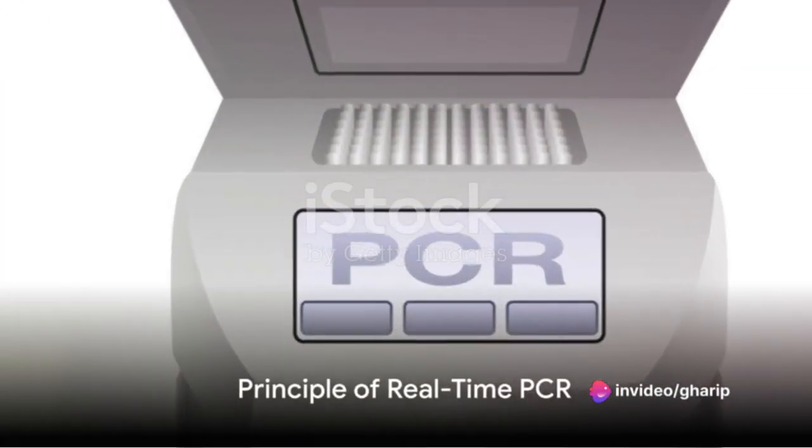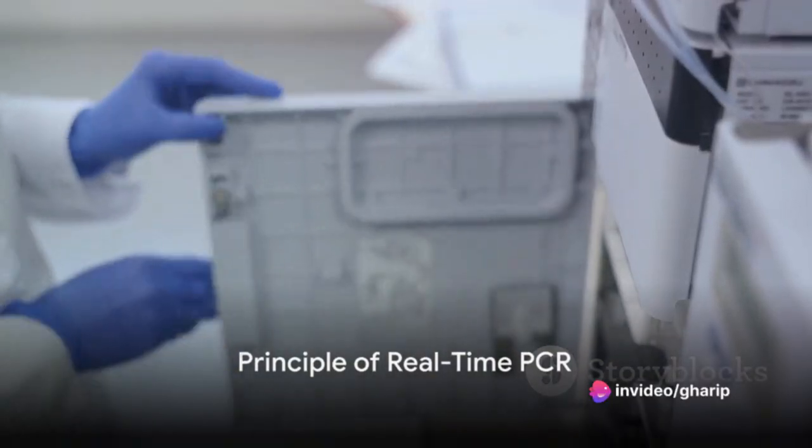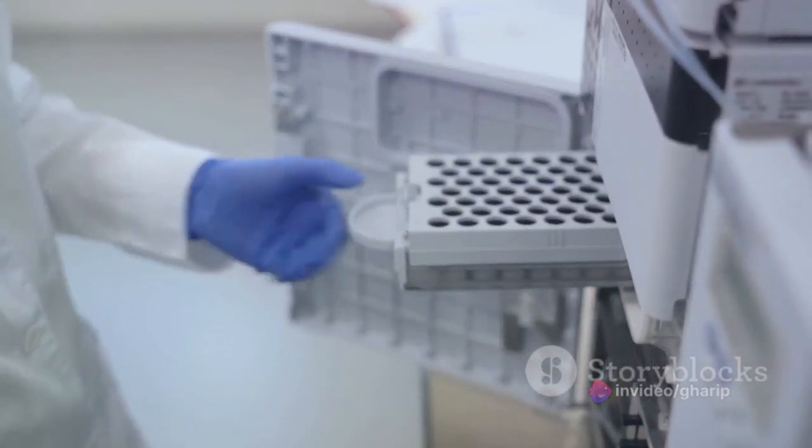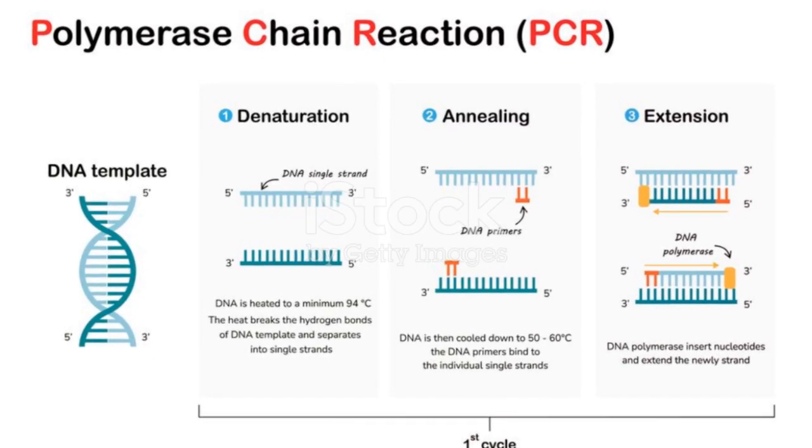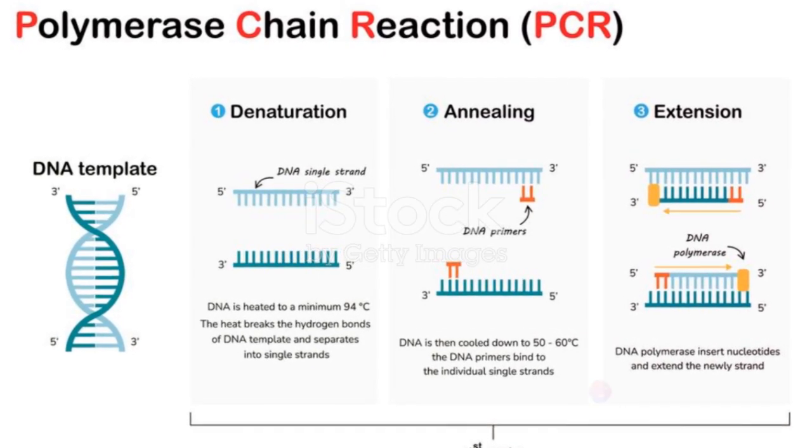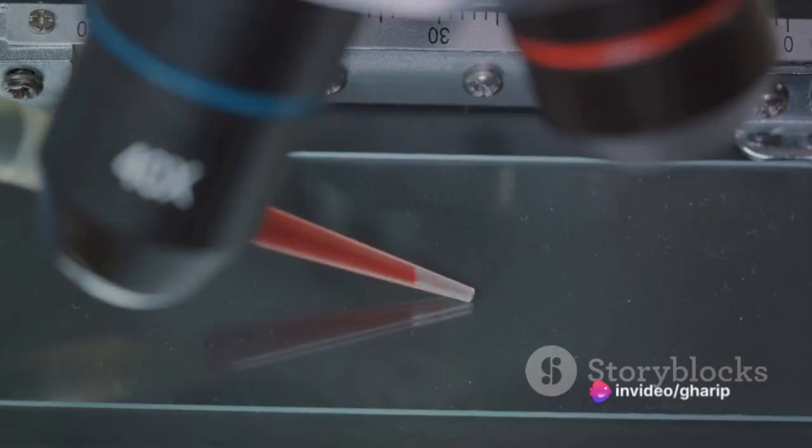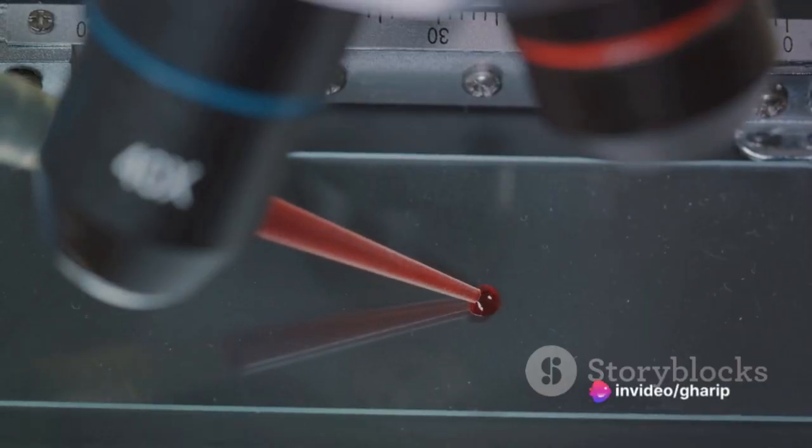Real-time PCR works on the principle of detecting and quantifying a fluorescent reporter, which increases proportionally with the amount of DNA. This is made possible by incorporating a fluorescent molecule in the reaction. As the DNA amplifies, the fluorescent signal increases.